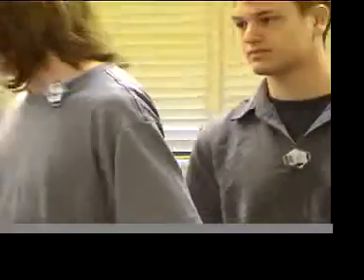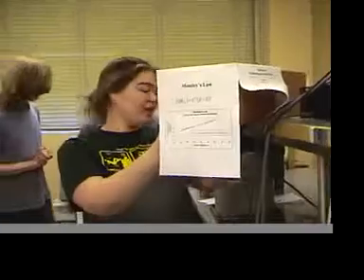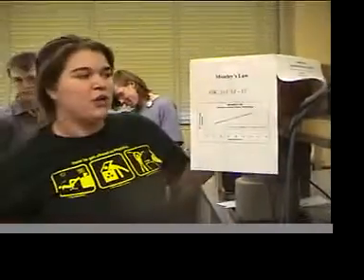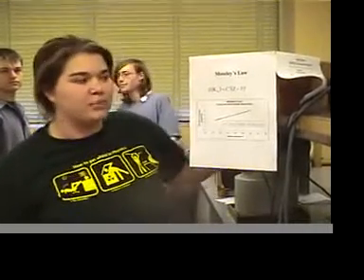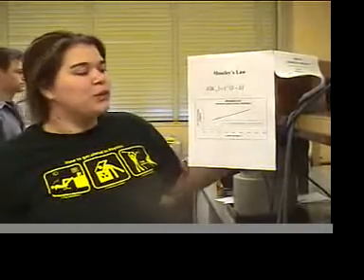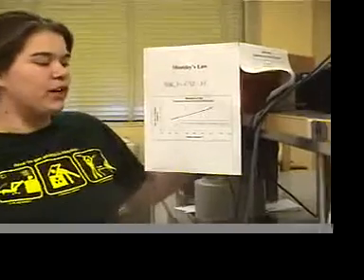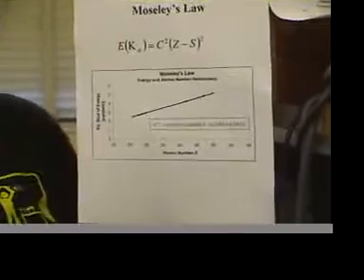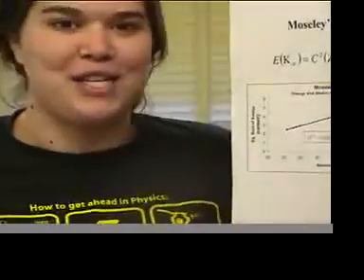However, we can also use this X-ray spectroscopy to confirm certain laws such as Moseley's. Henry Moseley showed that the energy transition for specific samples directly related to the atomic number of that sample. So we were able to test multiple samples and determine a relationship between the square root of the energy of the transition and the atomic number. We were able to then use this relation to determine the composition of our samples.